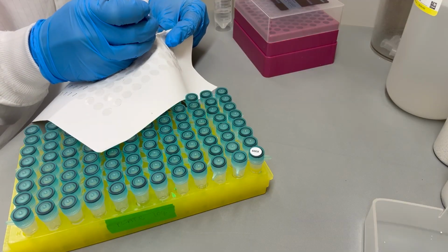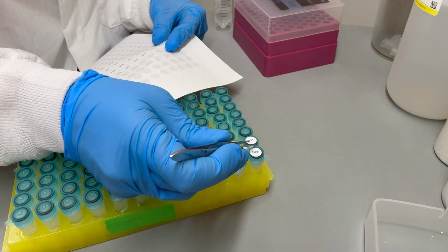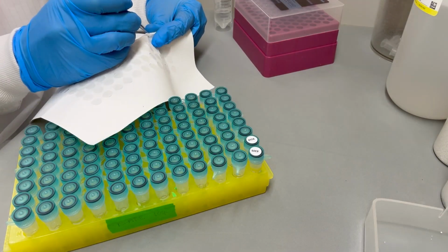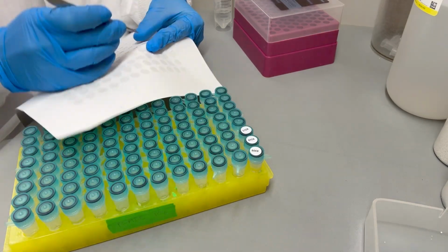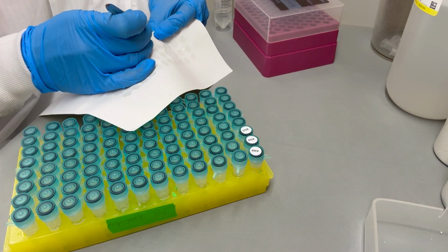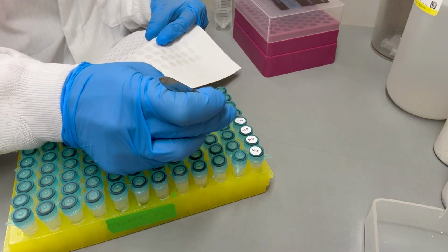The last final step is to just label the tubes. I add a unique number to every tube so that in the field we can just record the tube number and then all other metadata can go onto a data sheet with that sample number.